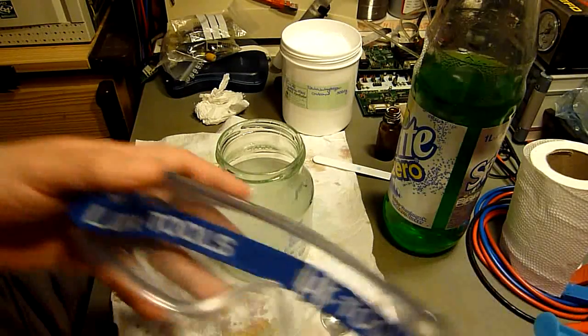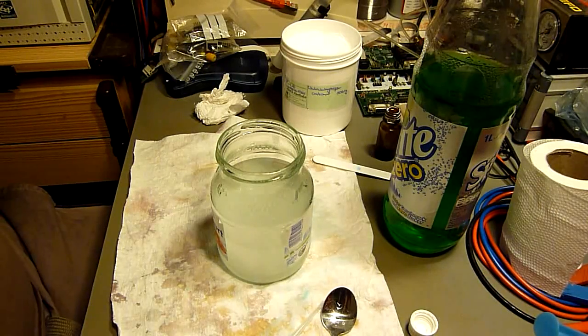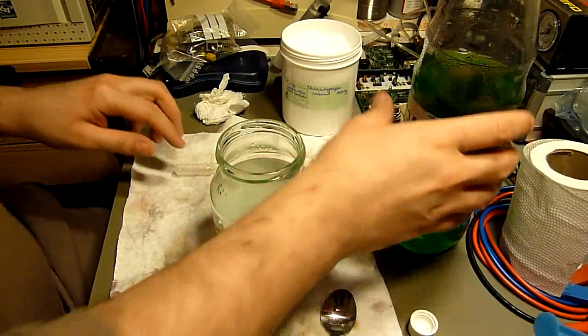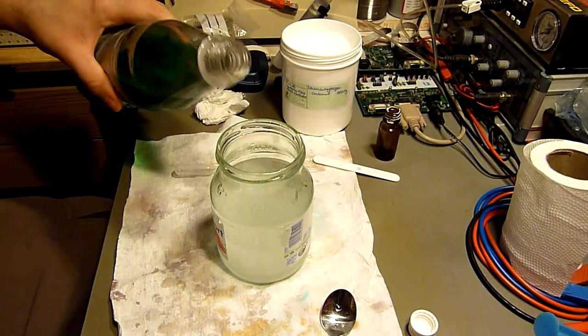I'm wearing protective glasses, just in case it should spread around so it doesn't hit my eyes. Now let's start the reaction and look what happens.